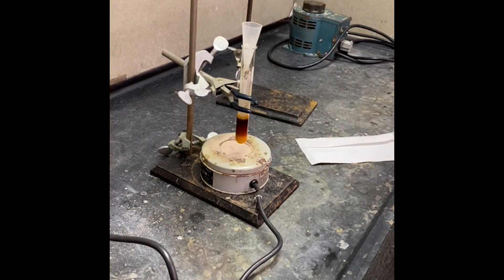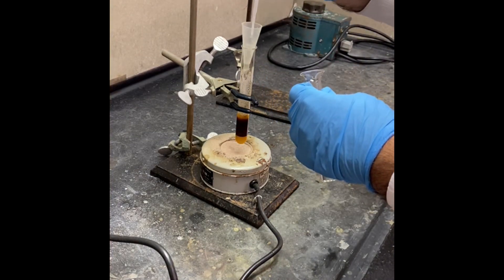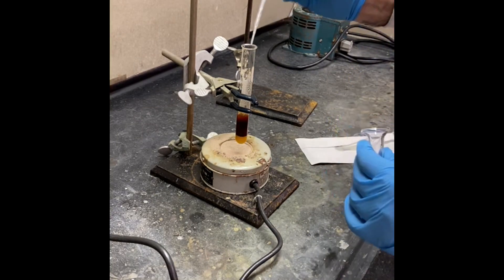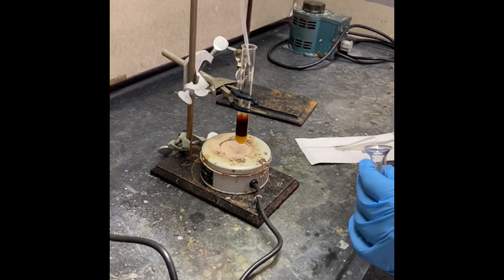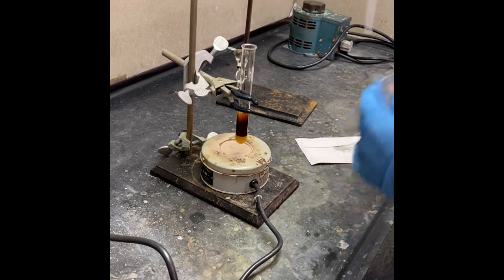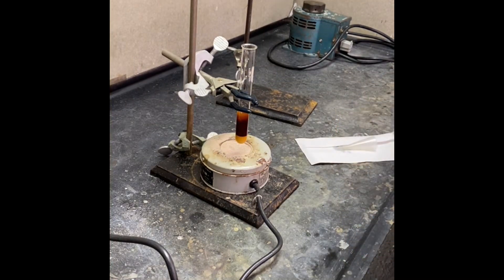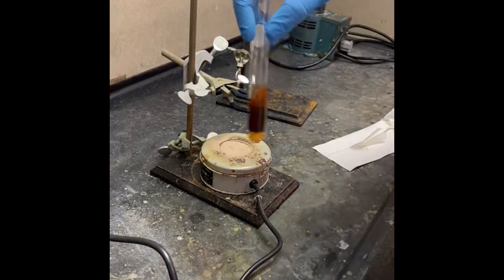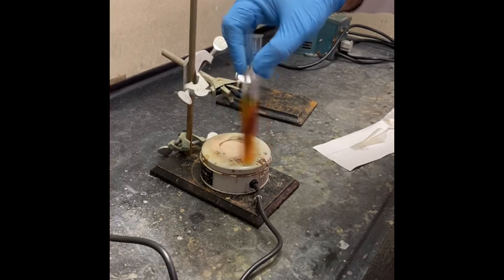Some is stuck on the wall of the tube, so we can use some water for that. I added around one mL of water, and let's gently swirl that.